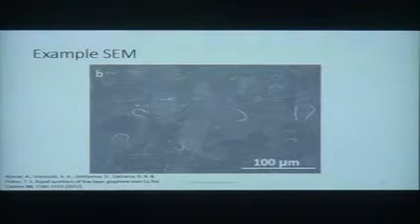But this would be something where you could at least tell yourself, have I grown graphene, and is there some kind of granular structure on the surface?